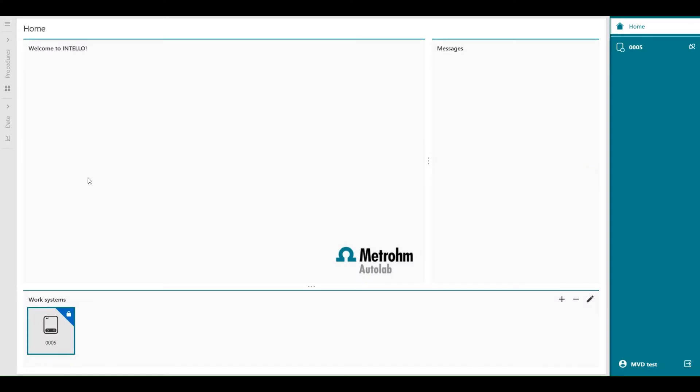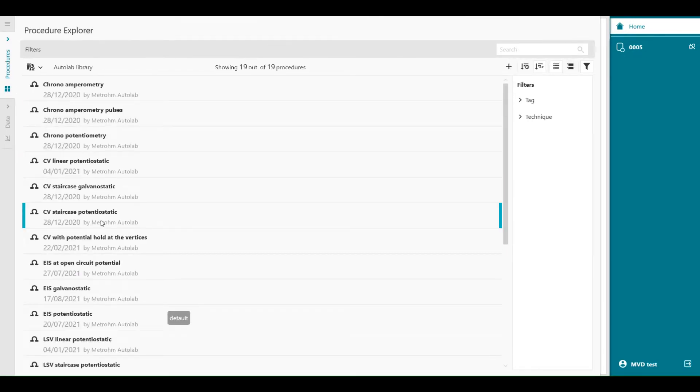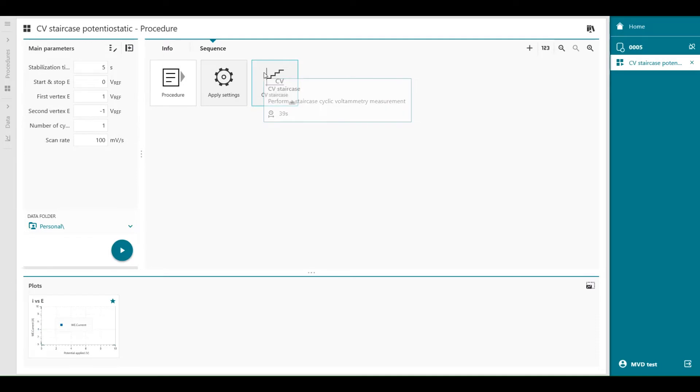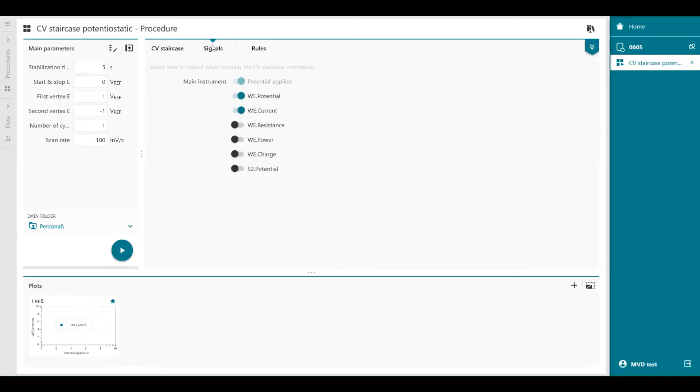Welcome to the Intelo software. In the procedures, you will find CV staircase potentiostatic. When I double click on this one, we can go to the sequence and go to the CV staircase command. When we double click on the command, in the signals tab, you will find S2 potential. When we enable it, this means that we can now measure the second sense potential with the same time as the working electrode potential.